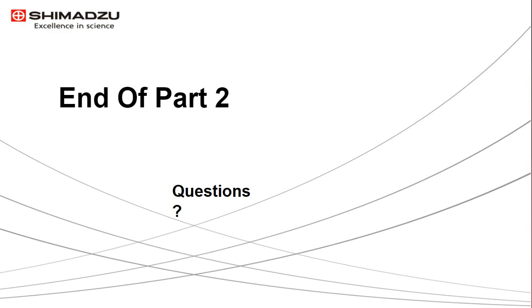Thank you. And just to follow up on that, while Shimadzu does include standard holders for films, powders, and nice flat samples, for any atypical sample like butterfly wings, we do provide help and consulting in a way to help you mount the sample properly and to get a good result.